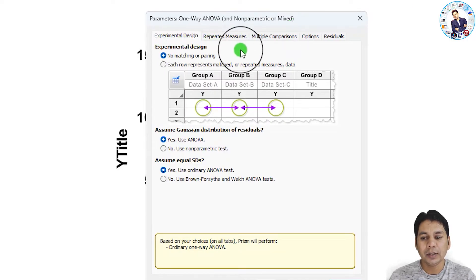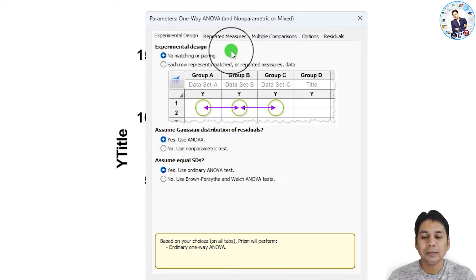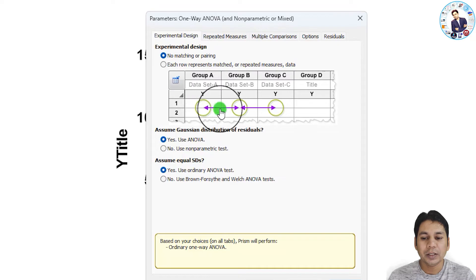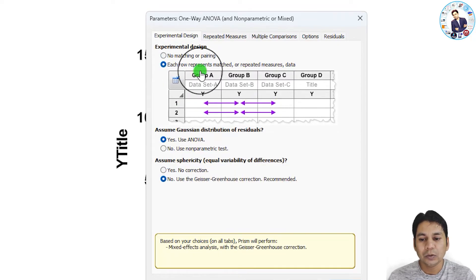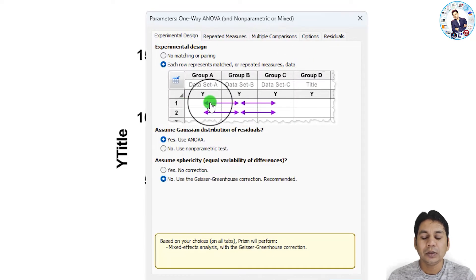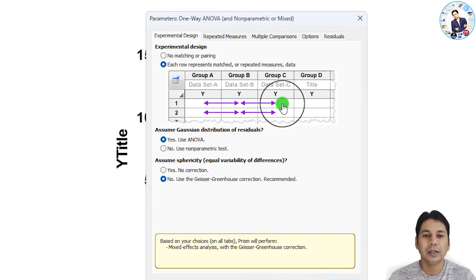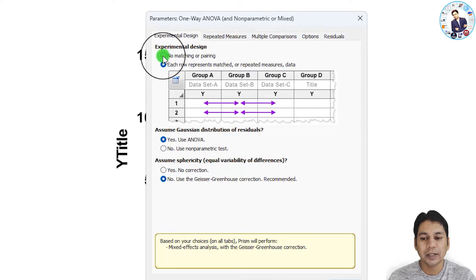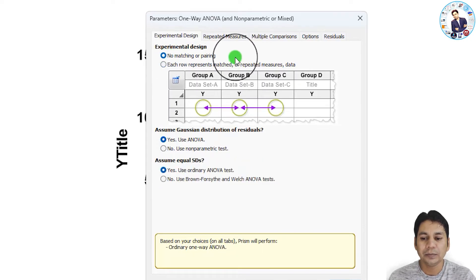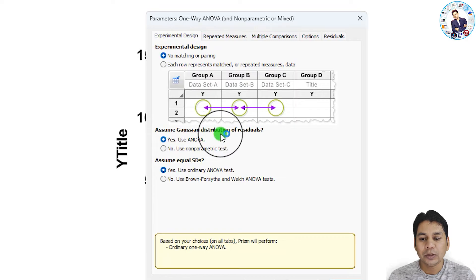A new window opens to select the parameters. Under 'Experimental Design', there are two options: 'No Matching or Pairing', meaning there is no matching between your group data, and 'Each Row Represents Matched or Repeated Measure Data', where each row represents a paired sample. In my case there is no matching or pairing, so I am selecting 'No Matching or Pairing'.